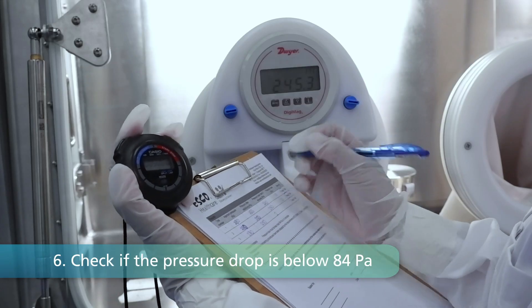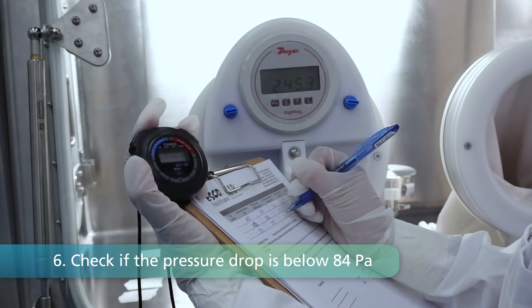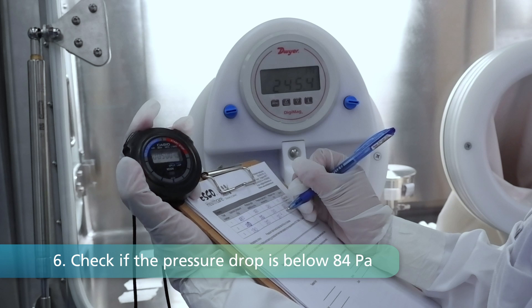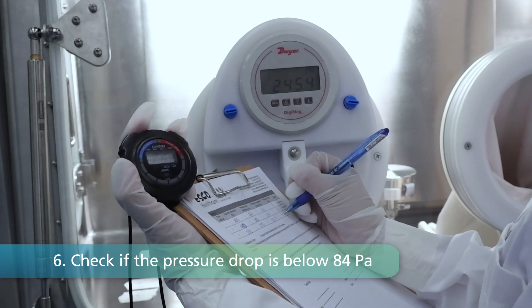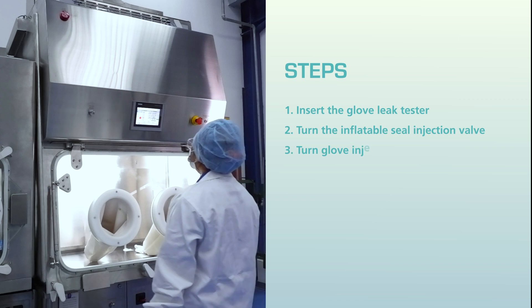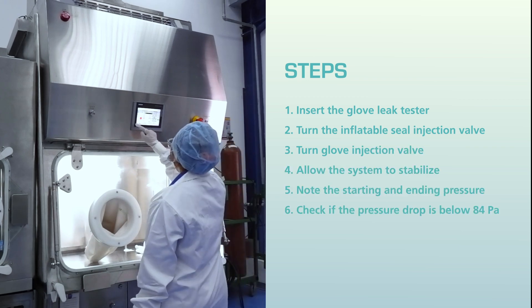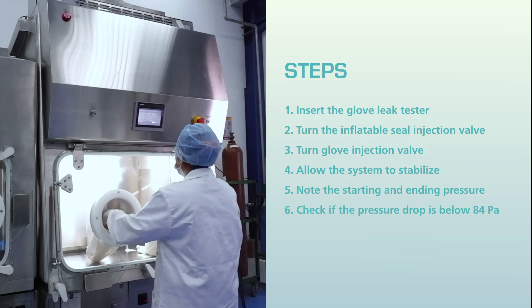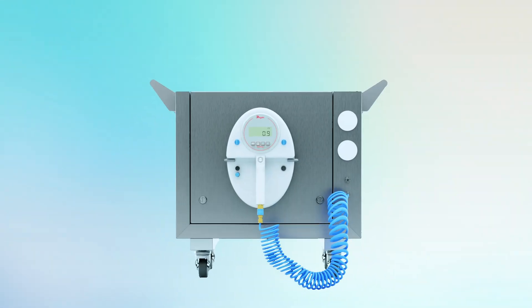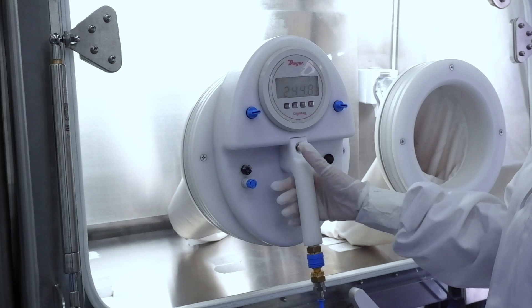Step 6: To confirm a successful test, check if the pressure drop is below 84 Pa. If so, the glove has passed the leak test and is ready for operation. With these refined steps, the Manual Glove Leak Tester becomes your reliable partner in ensuring the highest standards of safety and quality. Elevate your safety standards with the Manual Glove Leak Tester — because your safety is our priority.